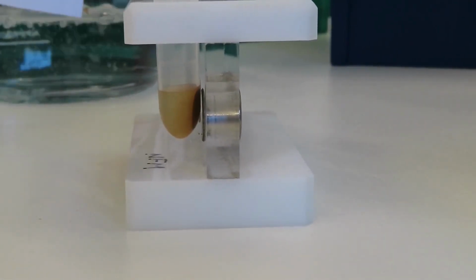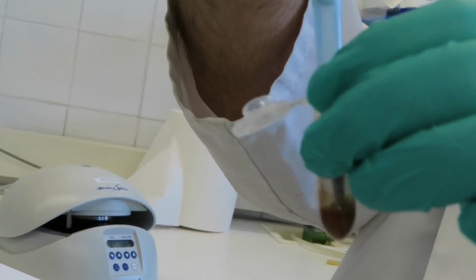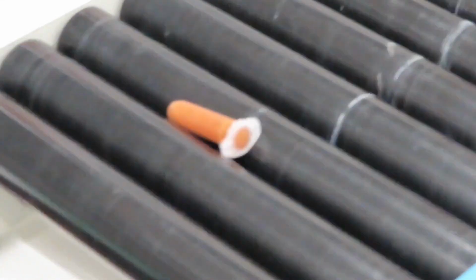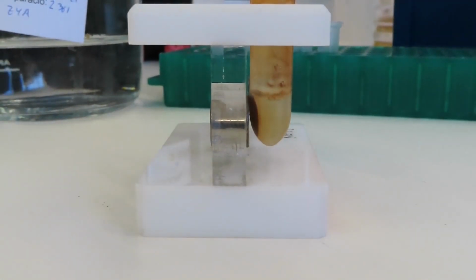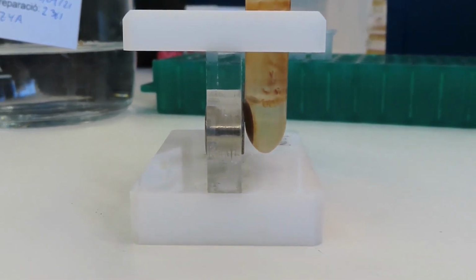Now is the moment to incubate the beads with the sample. The beads are suspended in this case with a sample containing the green protein GFP with a histidine tag. The tube is then maintained under agitation for 5 to 10 minutes in a roller. We have chosen the GFP protein in order to better show the purification method. Once the incubation has finished, the tube is placed into the magnetic rack to separate the beads and remove the unbound protein and cell debris.